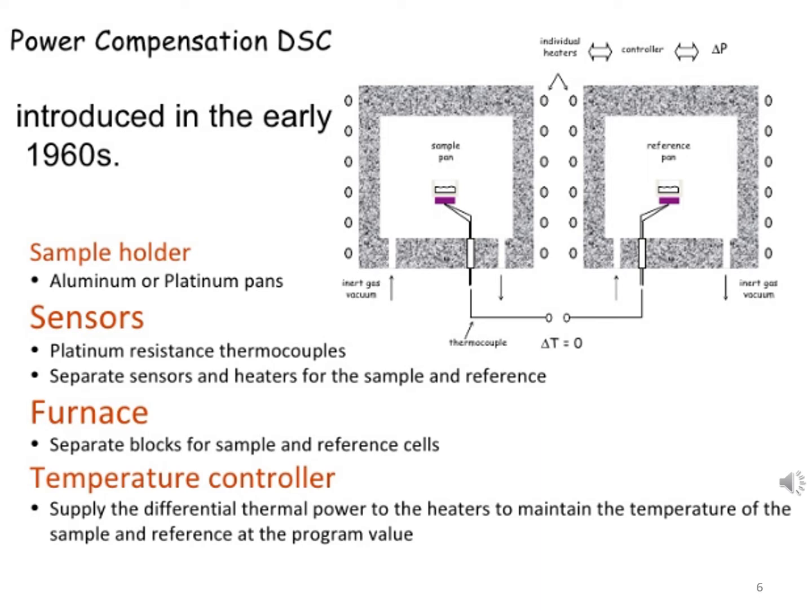This is the first part, the sample holder, that we discuss in every thermal analytical method. So in DSC, the sample holder is made of aluminum or platinum.